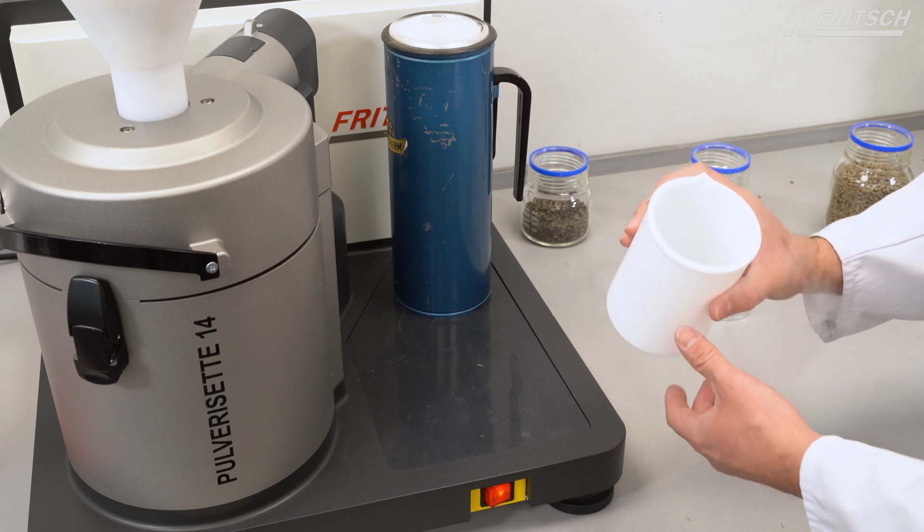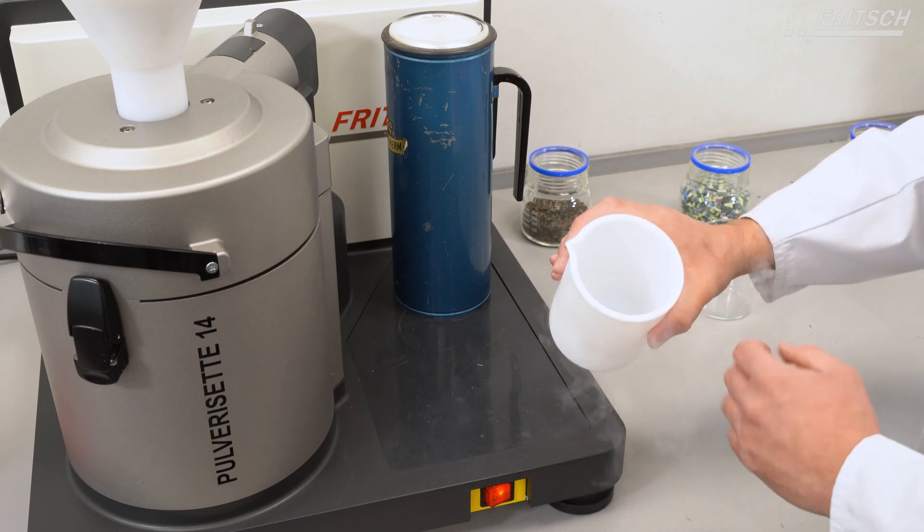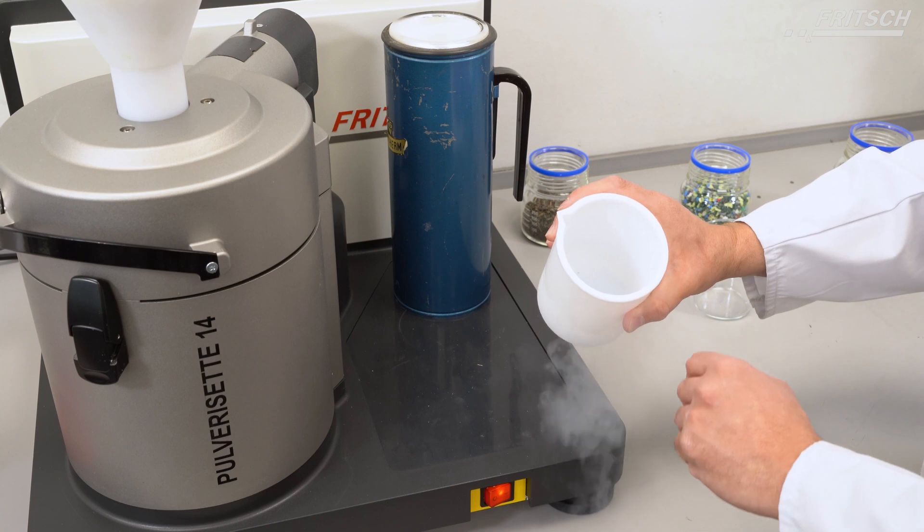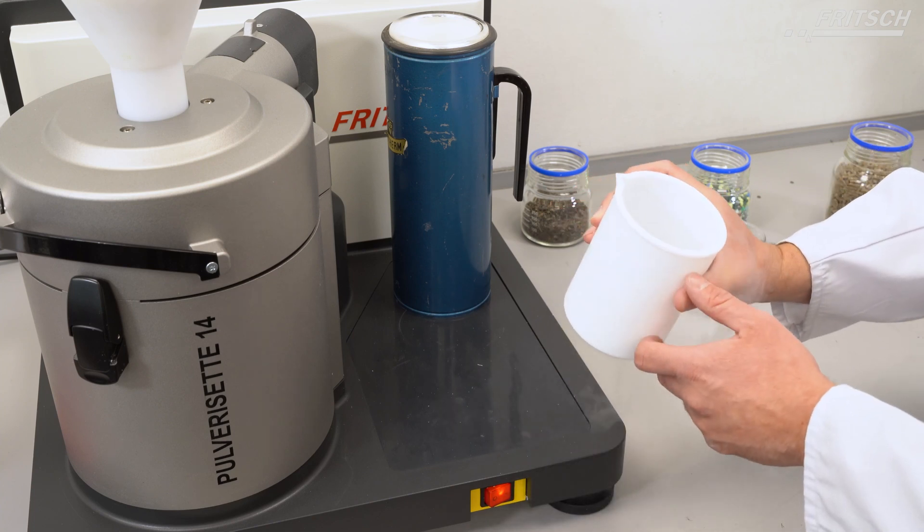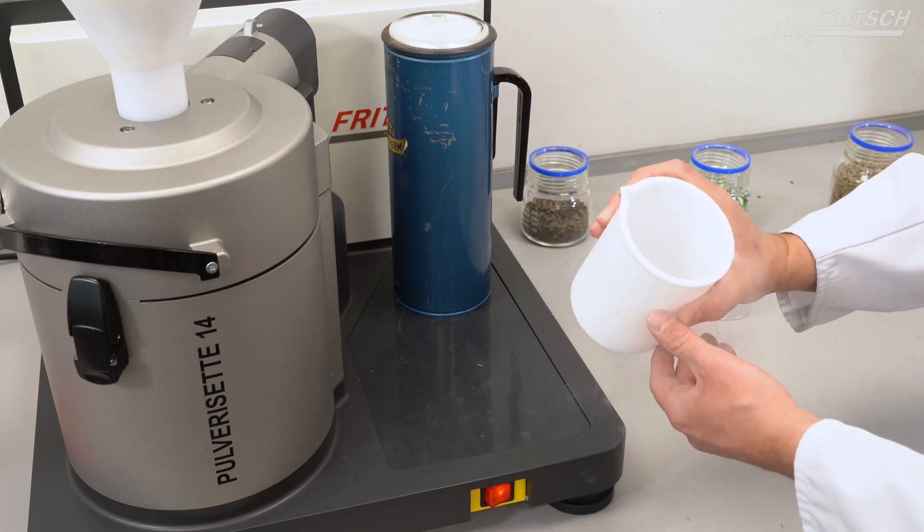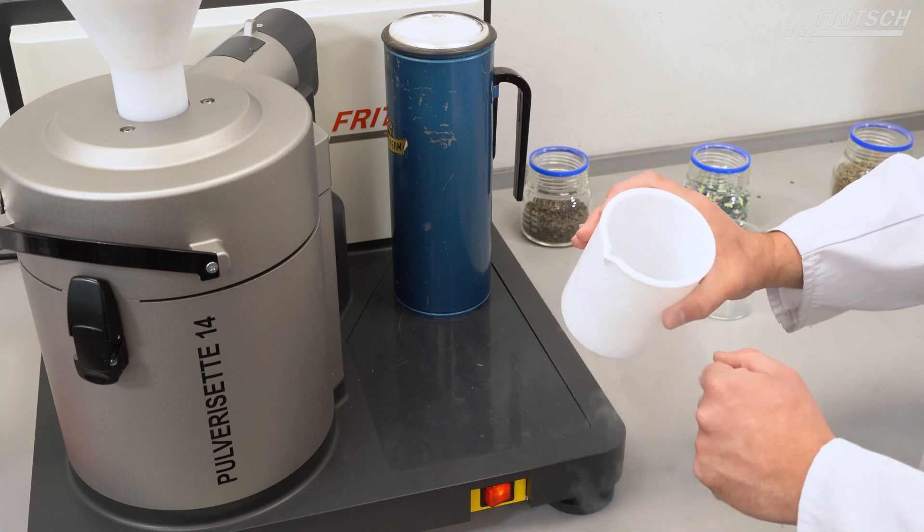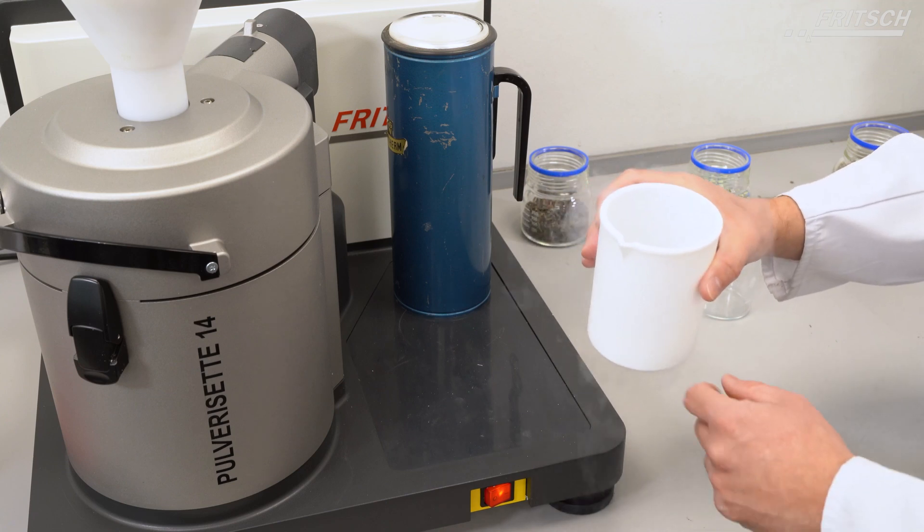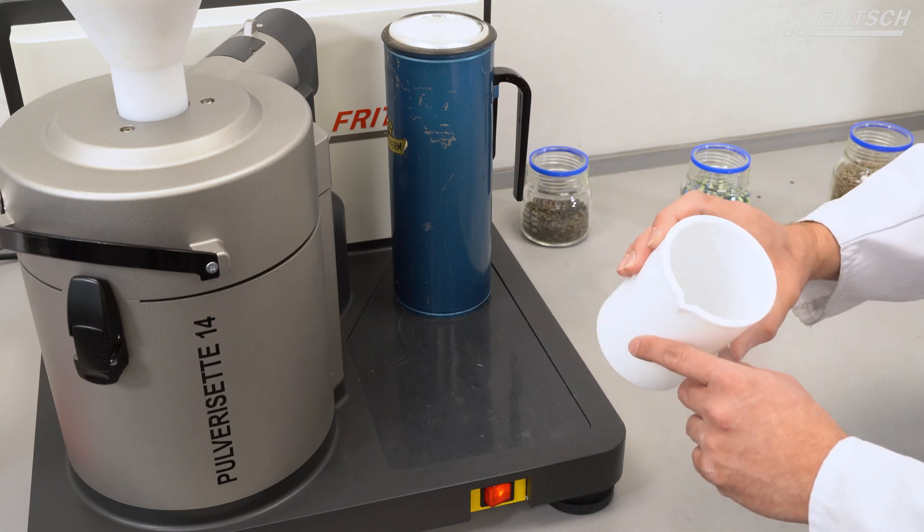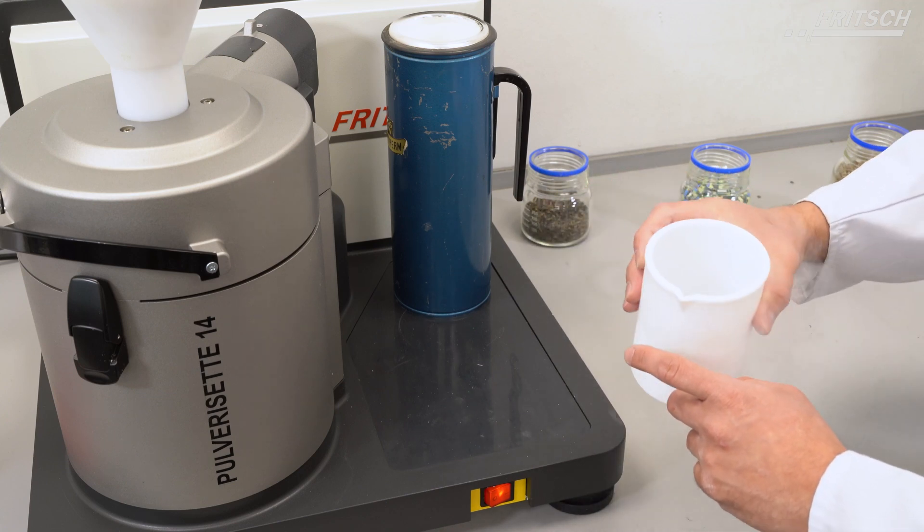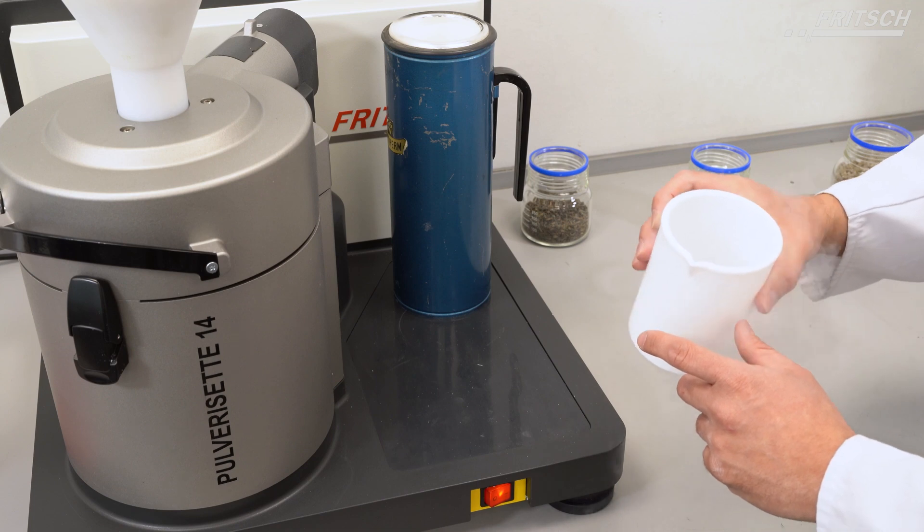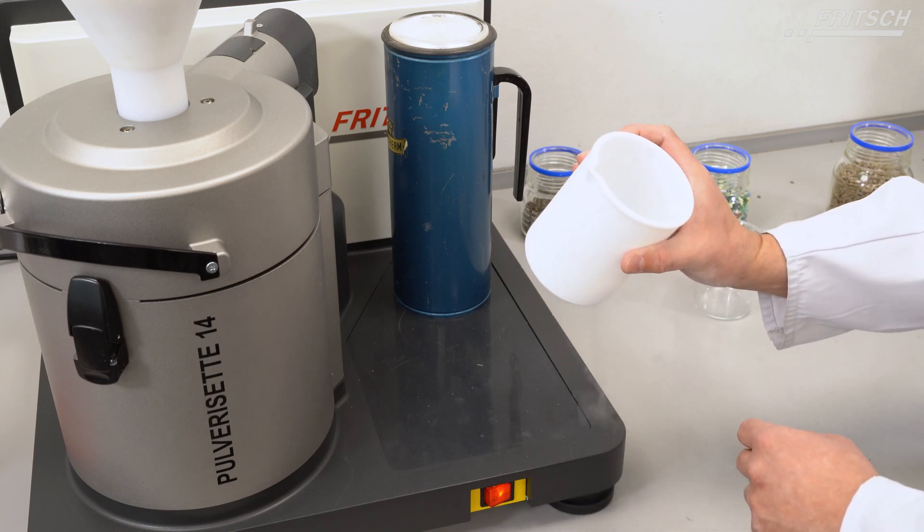For the grinding step it is very important that the whole rest of liquid nitrogen is evaporated and no rest of liquid nitrogen is in this vessel. Any residue of the liquid nitrogen which will be transferred to the mill for the grinding process might lead to an explosion.